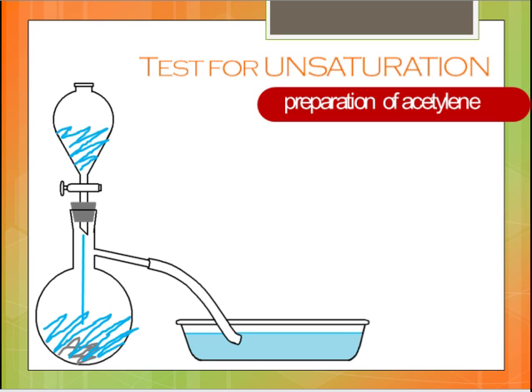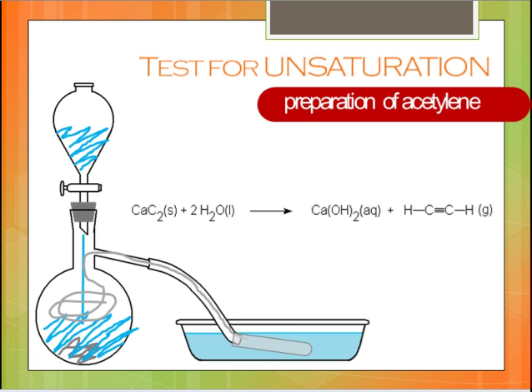The process here is that we will let the water slowly trickle into the flask. Upon contact with the calcium carbide, acetylene gas will be formed. As soon as we observe this, we place the rubber tubing into the test tube and invert the test tube vertically in such a way that the mouth is still submerged. The gas will then pass through the rubber tubing and into the water-filled test tube. The acetylene gas will then displace all the water in the test tube. Finally, we fit a cork in the test tube and we have acetylene gas in a tube.